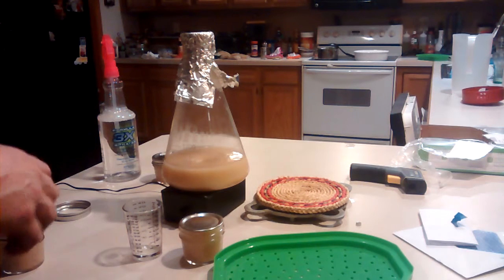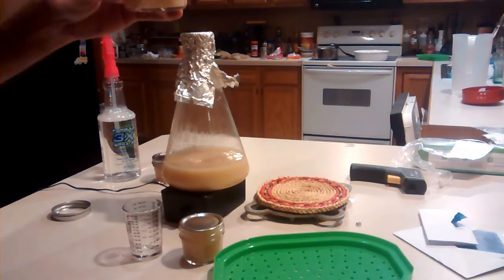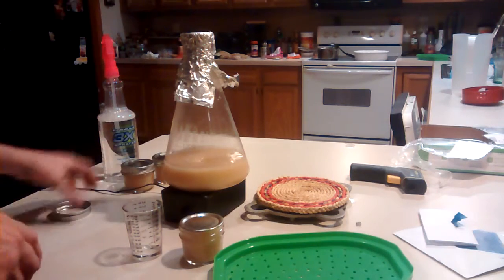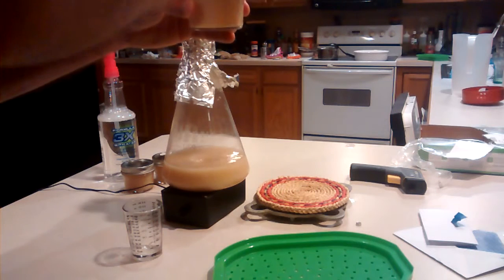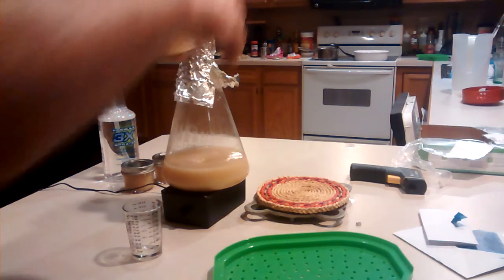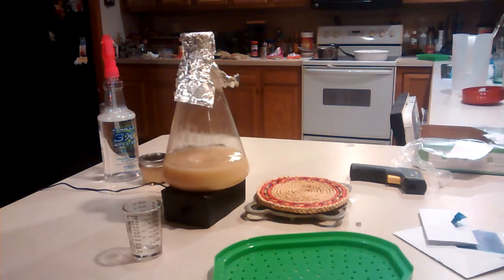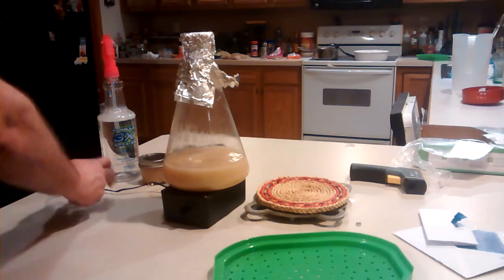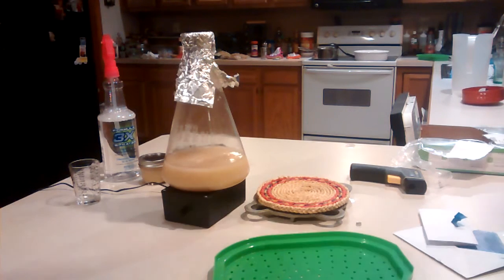I'm going to set them on the counter for a little bit, and probably put some masking tape on them and mark them with today's date. And Safale S-04, and call it Gen 1 because it's 1 generation off of laboratory yeast. So it should still be plenty healthy. I probably won't go more than a generation or 2 down, though. From what I understand, you can go as much as 6 and not have too much to worry about if your practices are sanitary enough. But that's good for now.